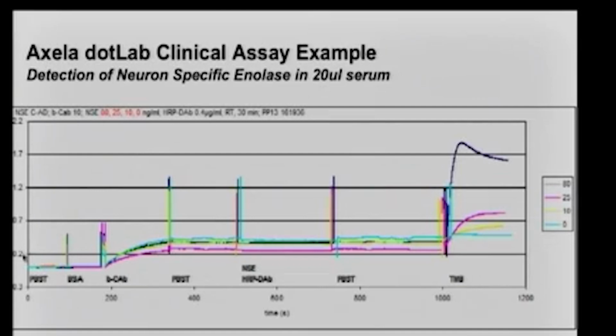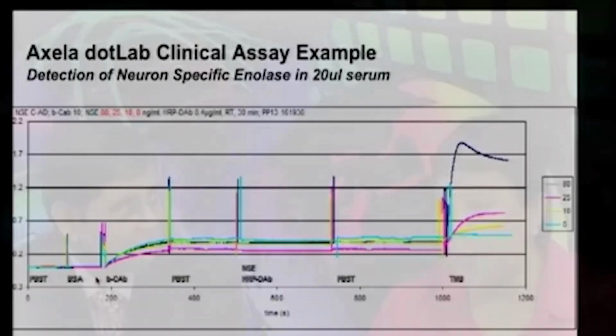And so here's an example where it's effectively the same as we've been discussing before. You put down one protein that identifies another protein, and sure enough, it works. As a physical chemist, I feel like if it works for one, it has to work for another. It's a question of how strong the signal is, which depends on how big the sample is.